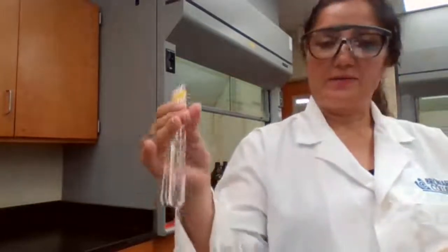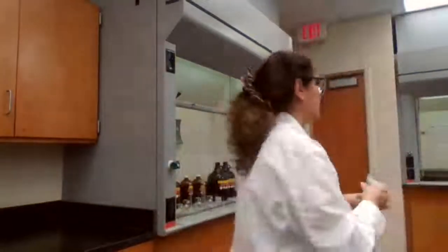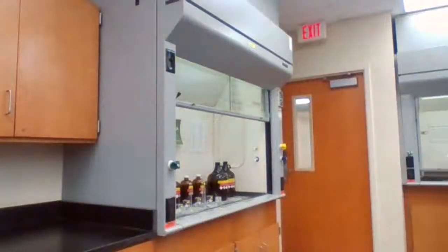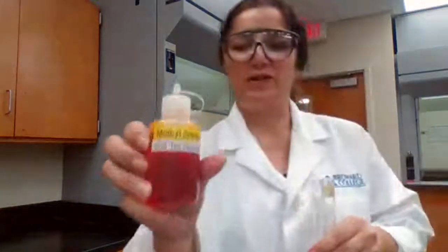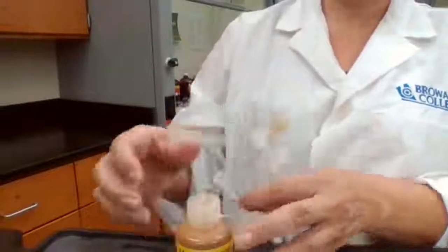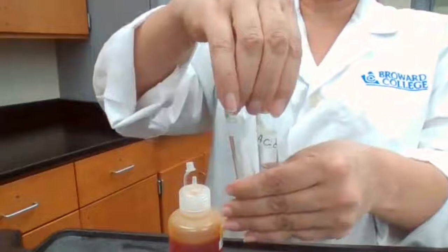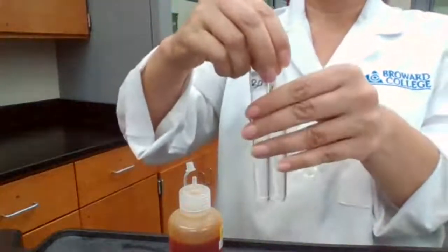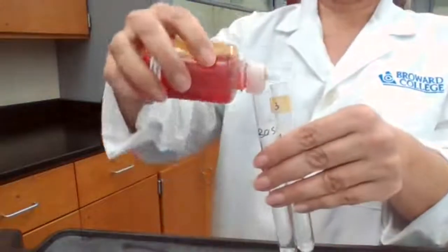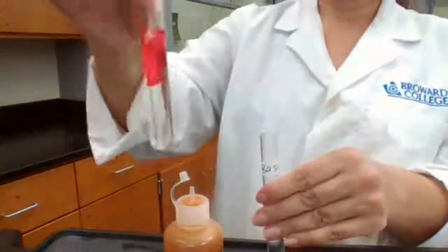We are going to add the methyl orange indicator to the 2 test tubes. This is your indicator, called methyl orange. We want to know what happens to the color of methyl orange in acid and in base. When we add it to the acid, the color is red.